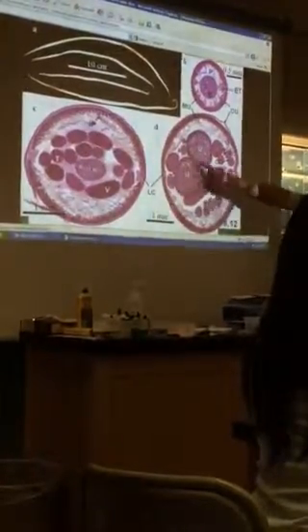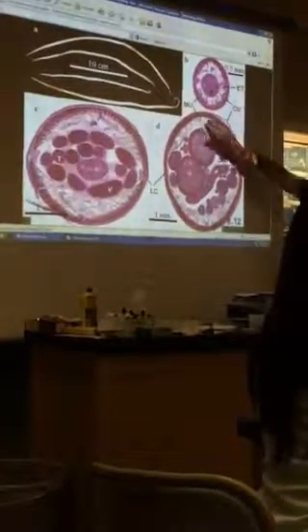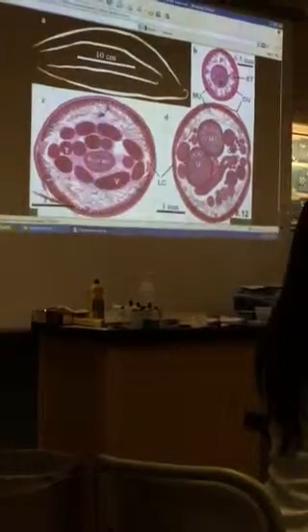If we look in the uterus, we can see eggs in there. It looks different inside. And it's also much bigger around. You see the musculature. Now, a lot of this stuff is late. I think it's on your sheet that you have to find.